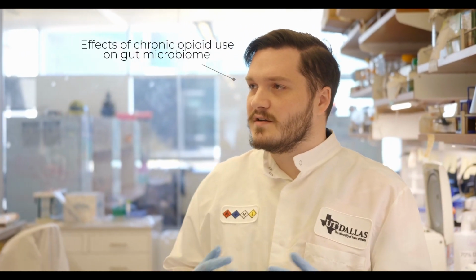My name is Clay. I am a research technician here in the lab. I have two areas of research. I am currently heading a group of 4 undergraduate students where we work with a neuroscience lab, and we look at the effects of chronic opioid use on the gut microbiome, and specifically how that changes enterococci populations in the gut.